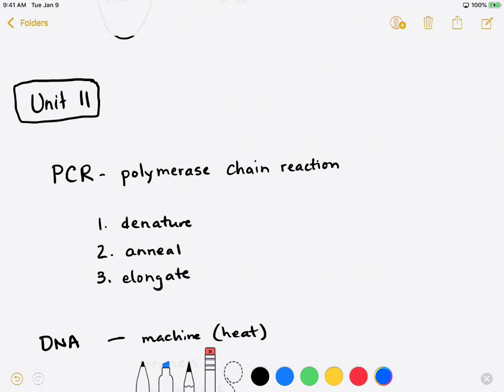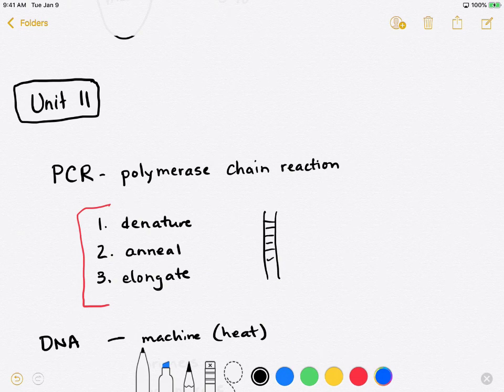In PCR, the three steps that we go through include, first, a denaturation step. In this step, the DNA gets heated and it opens up the DNA into two single strands. There's a great diagram of this on page 95 in your lab manual. We can imagine that at the first step, our DNA is all stuck together. When we denature that DNA, it pops open.